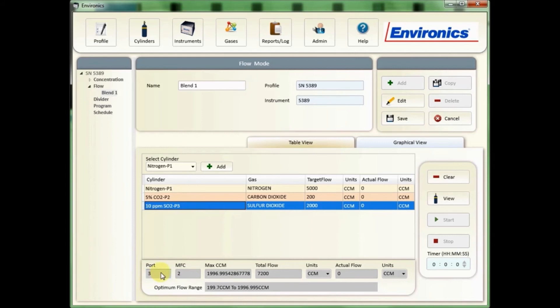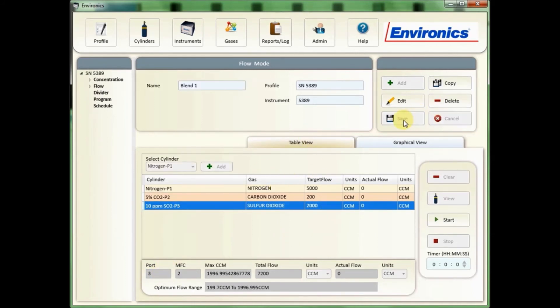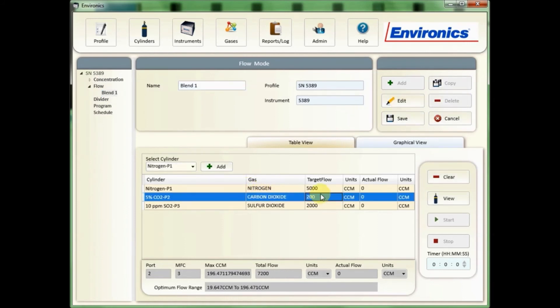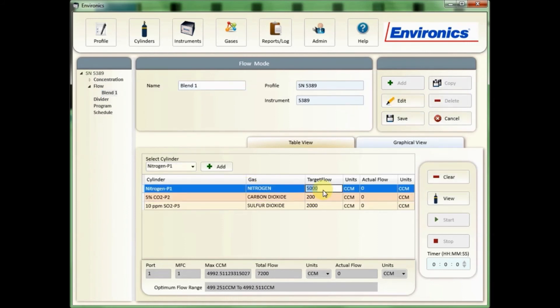So once you have everything entered here as you want it, you simply click save and the flow mode is saved here at blend one. To edit, click on the pencil and then make any changes you need to make. Let's say I want to make the flow 4 liters, and then again click save. Pretty simple.